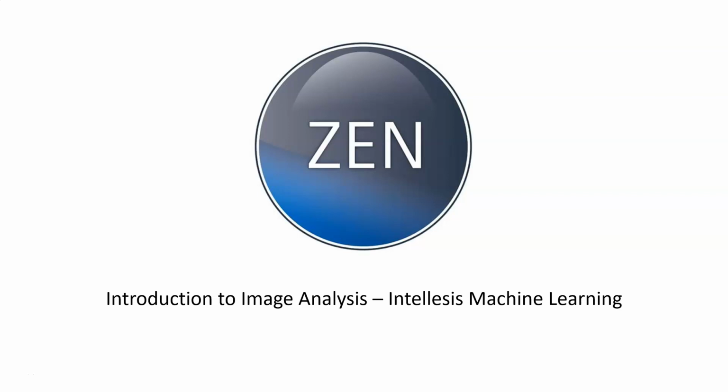This tutorial is intended as a supplement to previous videos on the ZenBlue Image Analysis module that discuss classic image analysis. Here we will expand on ZenBlue's capabilities by introducing the workflow for machine learning in image analysis. This tutorial does not require that you are familiar with the concept of machine learning, and in some ways presents a simpler workflow than that of classical image analysis. For an understanding of what is happening under the hood, so to speak, please refer to a companion video titled Introduction to Machine Learning in Image Analysis.